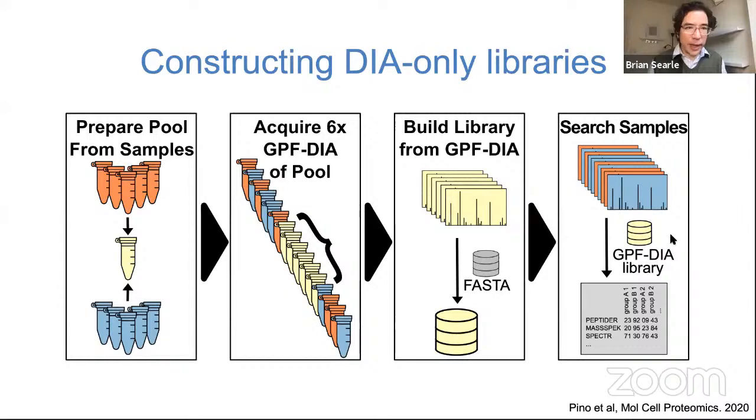But if you do put them in, I recommend putting them into whichever samples you're interested in monitoring. So put them into the same sample, injected into the same sample, so you have a certain amount of them. Essentially, this can be a nice kind of online quality control if you have these peptides around. Again, they're not necessary, it's just if you have them around.